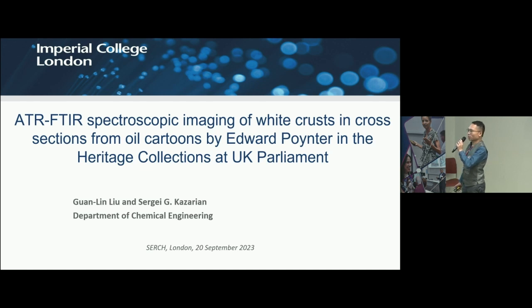My PhD research focuses on the application of ATR-FTIR spectroscopic imaging in the investigation of cultural heritage objects. Today I'm going to talk about the research where we investigate a white crust found on the painting produced by the painter Edward Poynter.